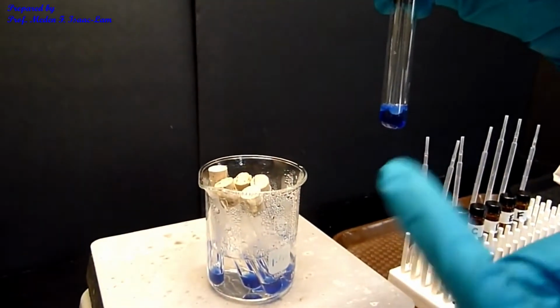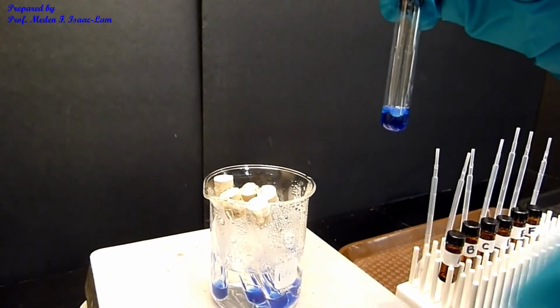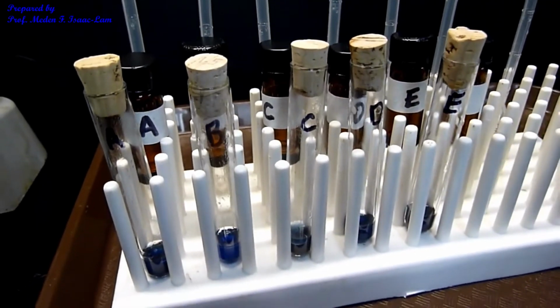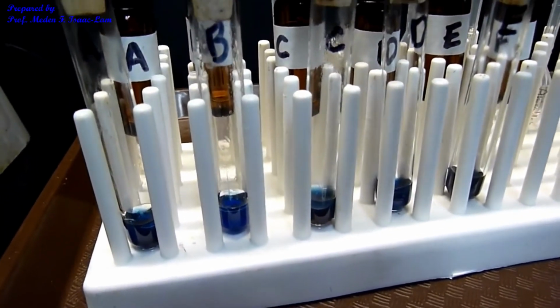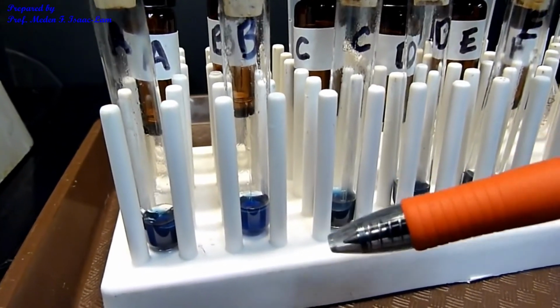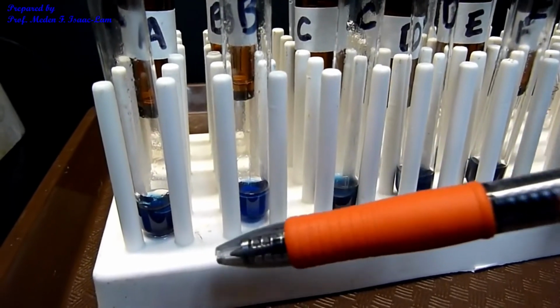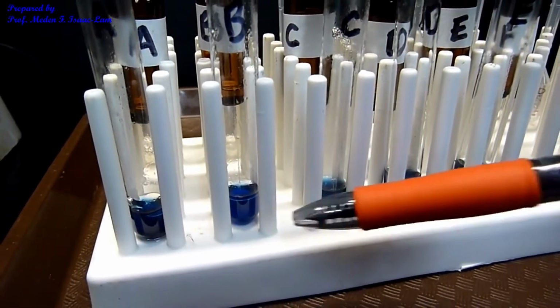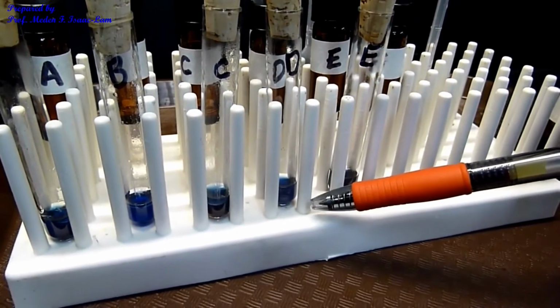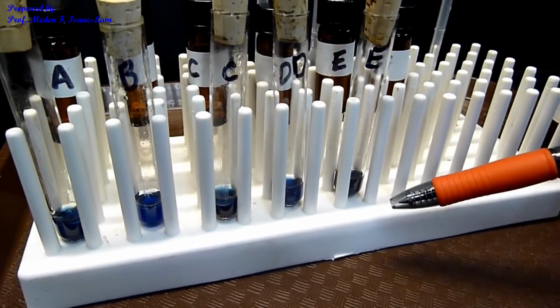We're looking for a greenish color first and then a red precipitation. So after boiling it for about 10 minutes, I took out A, B, C, D, E, and nothing really changed to it. It's still dark blue. So A, B, C, D, and E did not really change color.